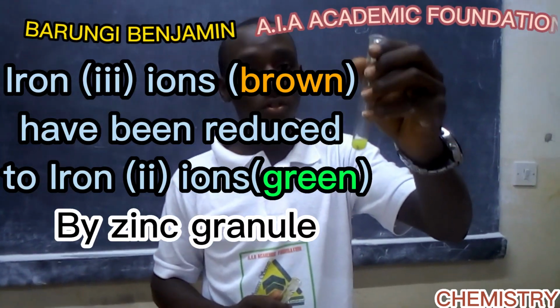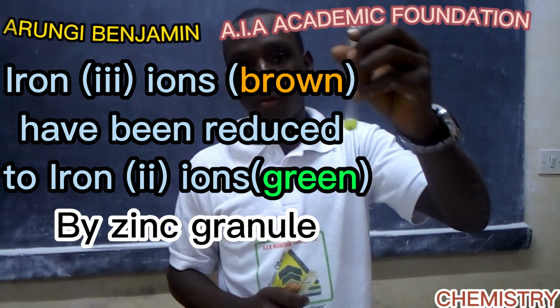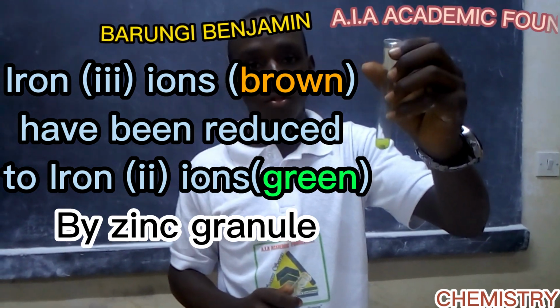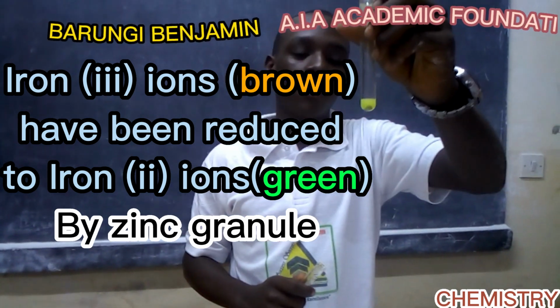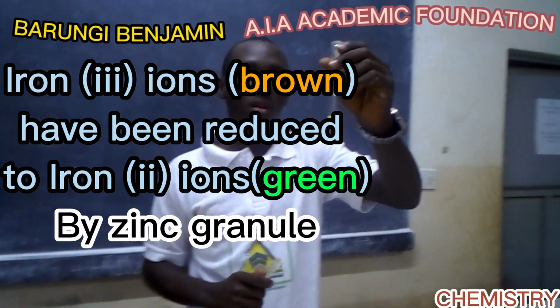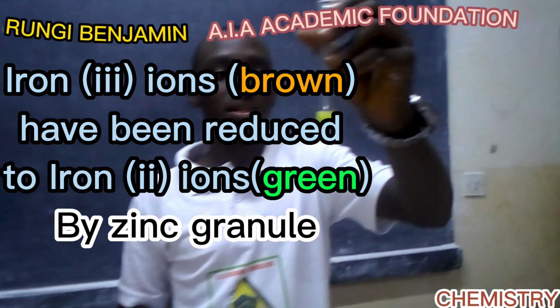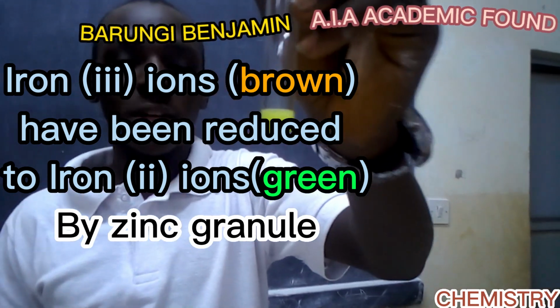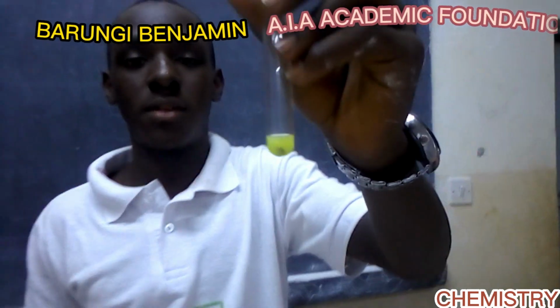They form green solutions, which means when you put the zinc granule it reduced iron 3 ions to iron 2 ions. So this solution contains iron 2 ions, because we're going to take it for a test. But you can check from the first appearance and the second appearance, they are quite different.